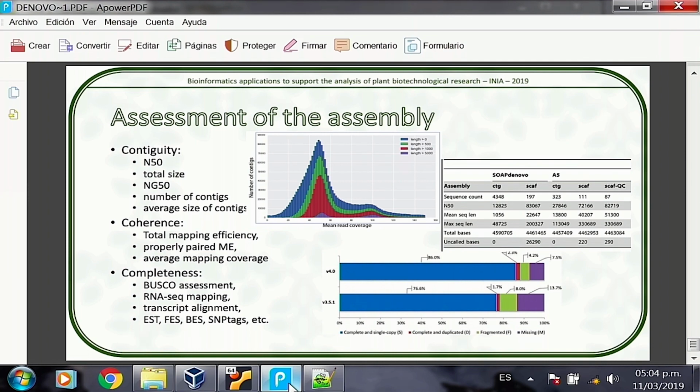It is unlikely. There are other methods, external methods, to test that. If you find a spot that has either way too much coverage or way too little coverage for what you were expecting, then you can design primers around it and try to do a PCR. If you get a result, and you sequence the result using Sanger, and it looks good, then there was something wrong with the library in that position. There is something particular at that position of the genome that doesn't allow it to be sequenced easily.